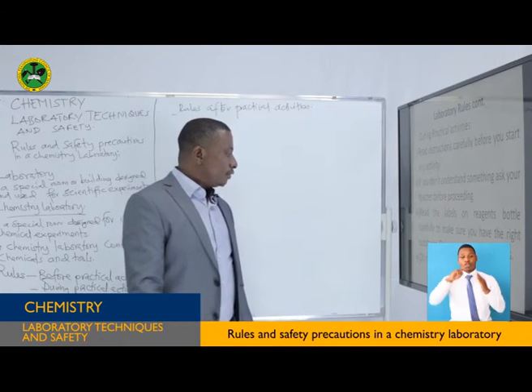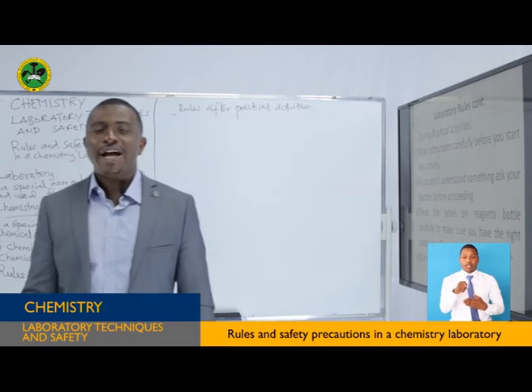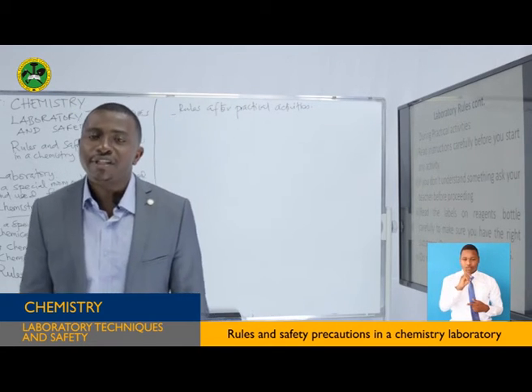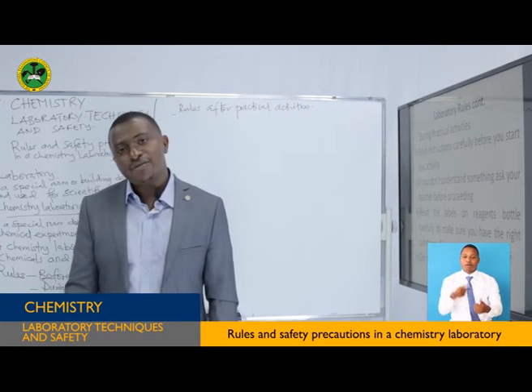Rule number 4, do not eat or drink in the laboratory. Students, I know most of you like eating and most of you like drinking. Please, it is strictly prohibited to drink or eat in the laboratory. Why? It's because within the laboratory there are harmful chemicals.